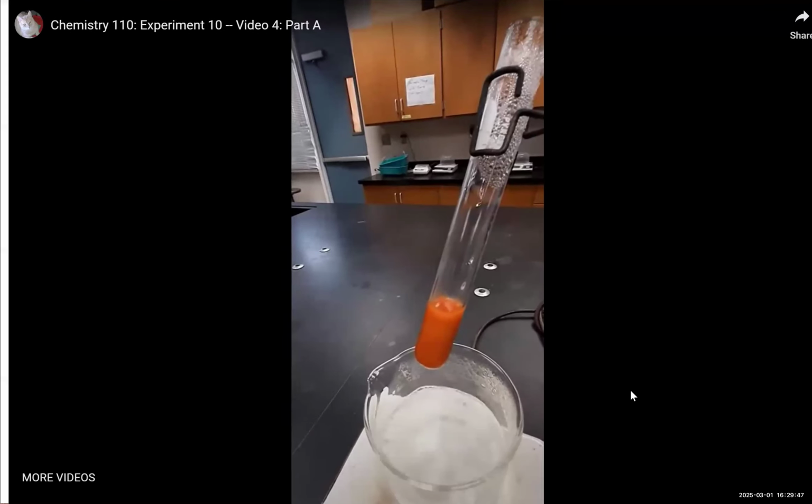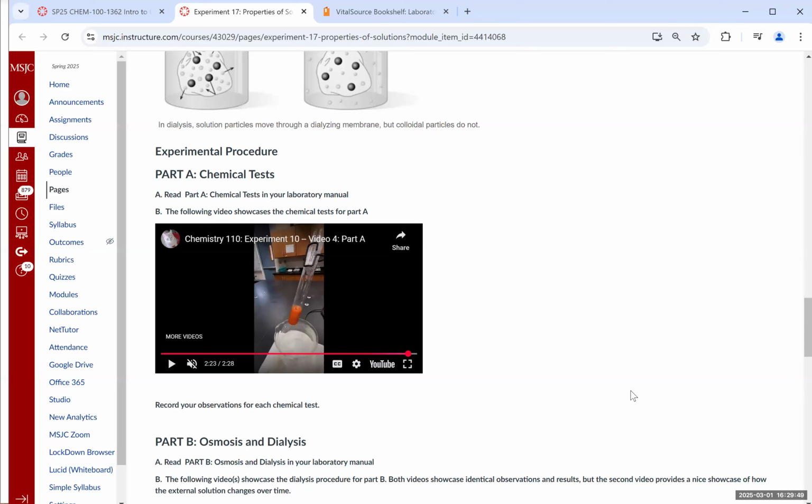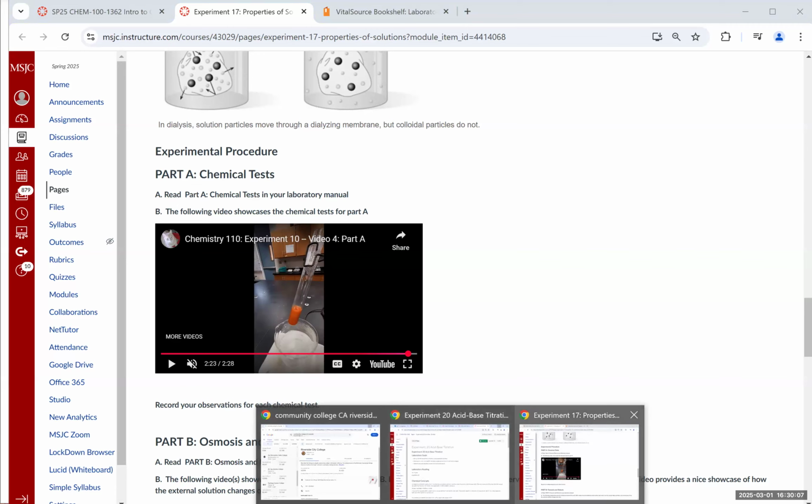Wonderful. I would encourage you to watch these videos as well with the sound on. I've turned the sound off because I'm providing my own discussion and narration for many of these procedures as part of this lab walkthrough, but I would encourage you, if you watch these videos independently, to watch them with the sound on if possible.